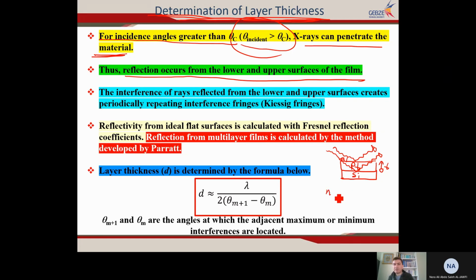So remember Bragg's law, n lambda equals 2d sin theta. Here, instead of d, just use the thickness of the platinum for this Bragg condition, okay? So theta changes. For some theta angles, we will have constructive interference at the detector, and for some theta angles, we will have destructive interference.